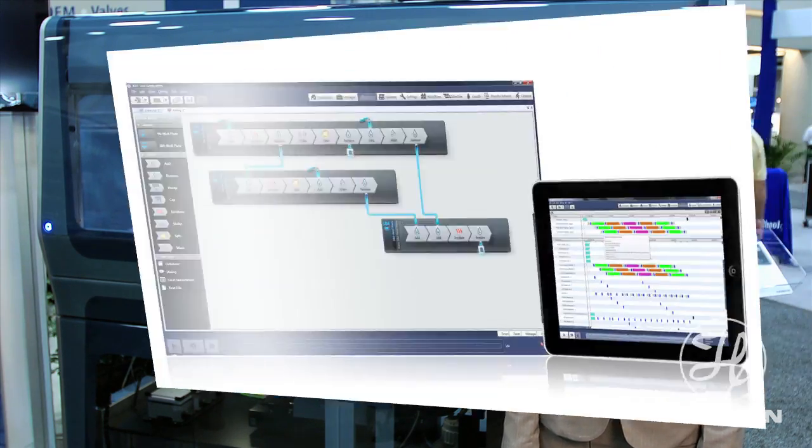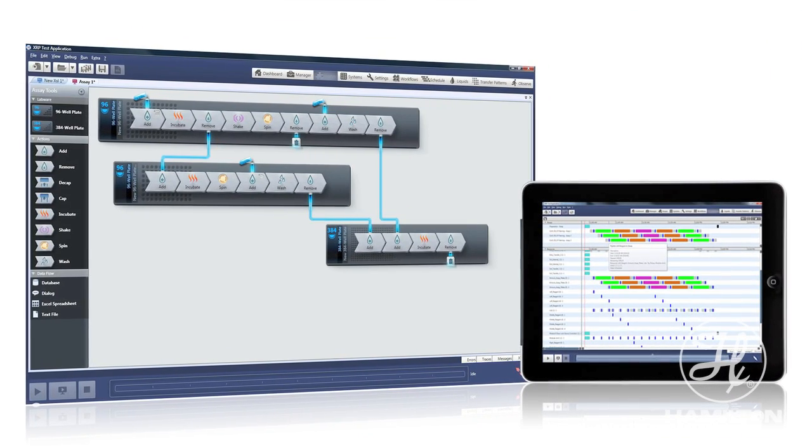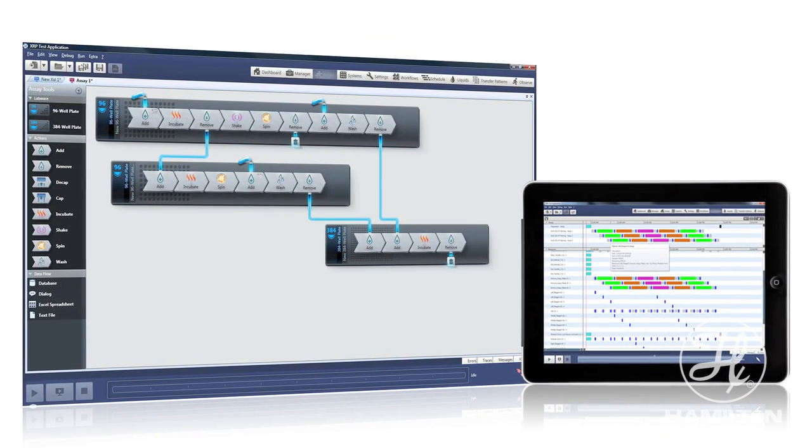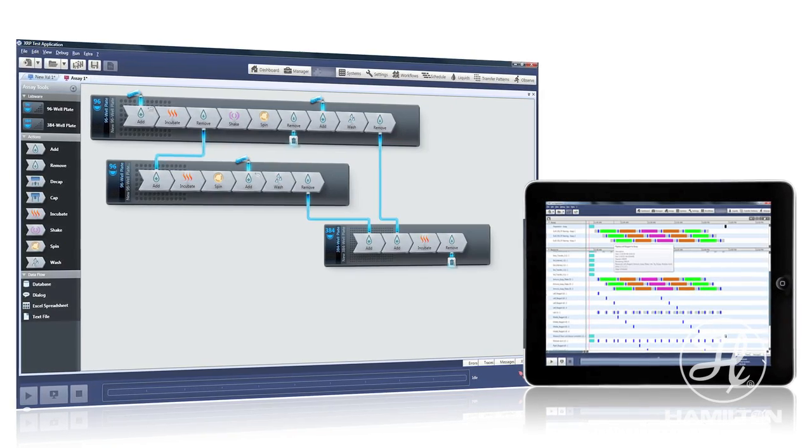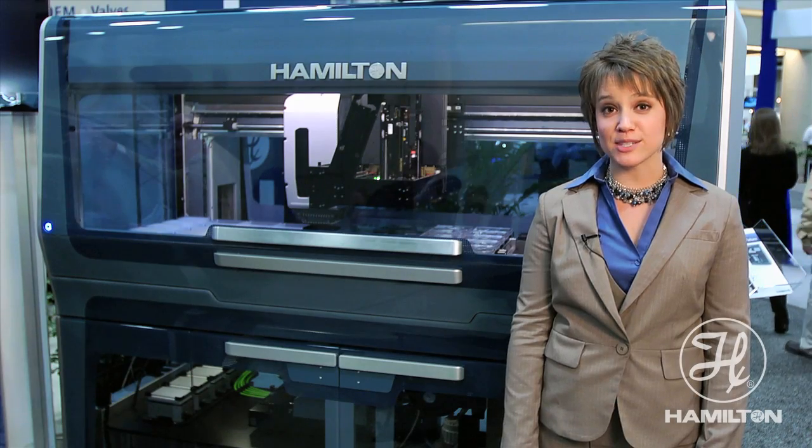we also feature XRP software. This software enables our users with a laboratory language through our assay editor. You can also remotely access the instrument through any tablet or any smartphone.